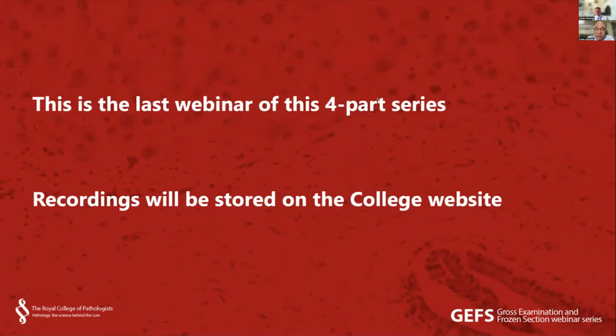Actually, this is our practice in our laboratory, but the name is not familiar to me, but probably somebody would have seen our reports. Yes, it's an interesting idea, isn't it? It's not something that I've ever done, though, I have to say. Yeah, so I think that traditionally we have been doing it because radiation therapists are interested in whether metastatic tumors are at the level of the tumor, or as you mentioned, if you have a splenic flexure tumor, you're not unlikely to find ileocecal metastatic lymph nodes.